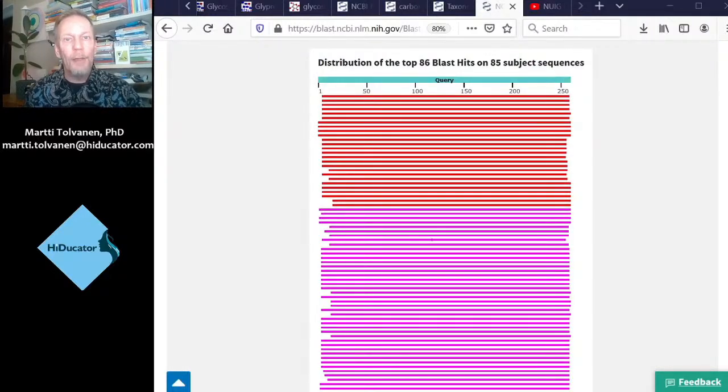Now let's go back to the graphical summary of hits, and you can see graphically now that the filtering of hits based on query coverage indeed had an effect, so that we have the N-terminus cleaned up. There are no very short fragments and just tiny bits missing from either end.